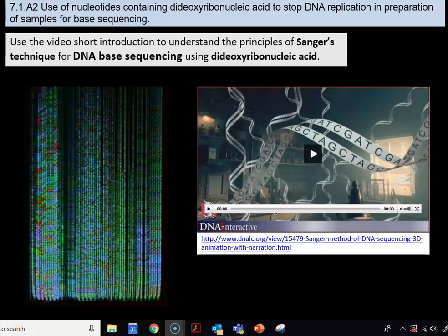Hello everyone, in this video we are going to talk about the Sanger technique, a very nice and excellent technique for DNA sequencing. So let's watch the video and see how this works.